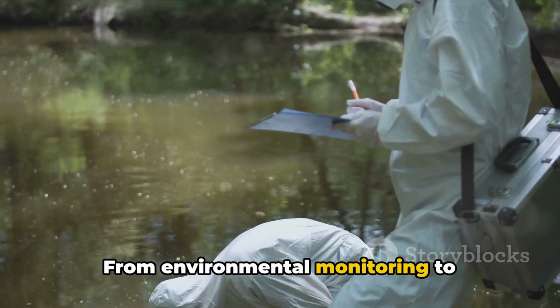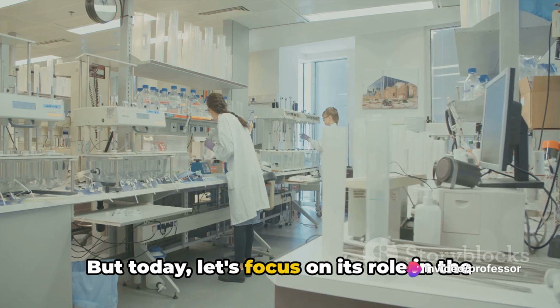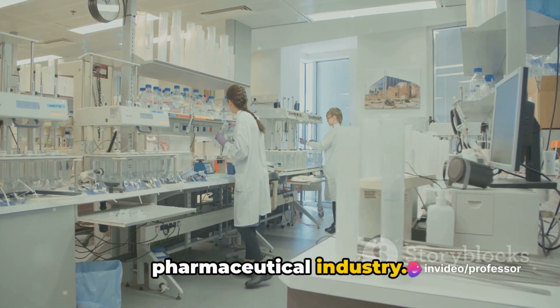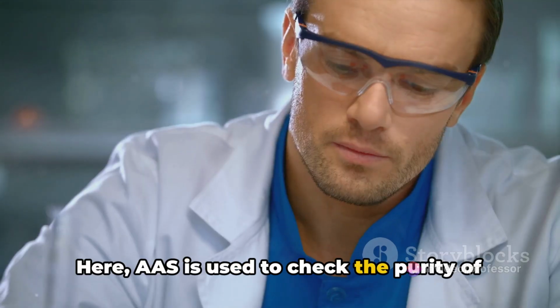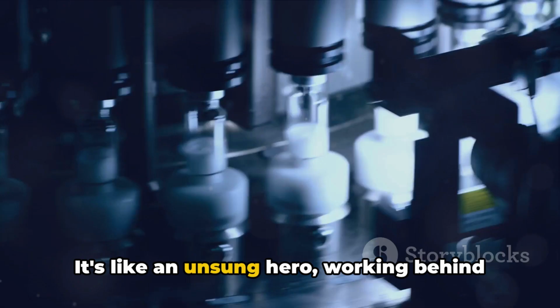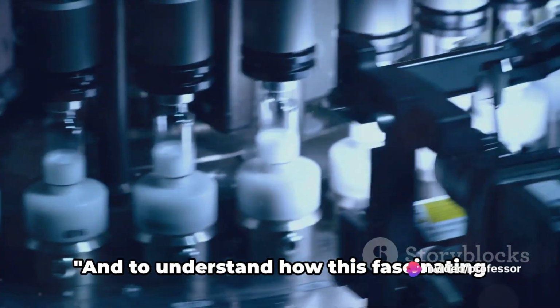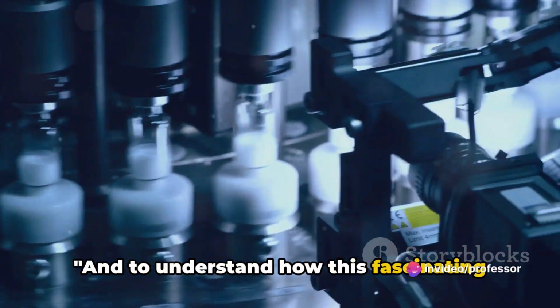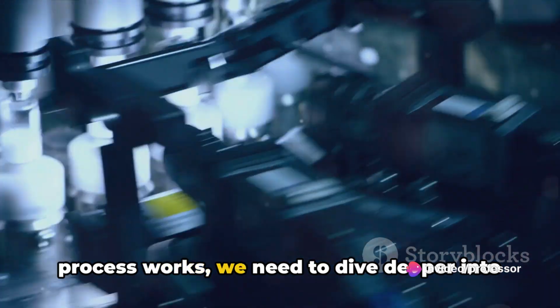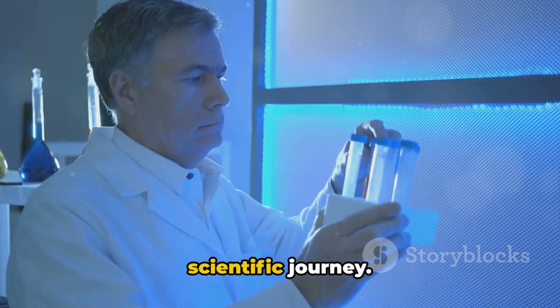From environmental monitoring to archaeology, AAS plays a crucial role. But today, let's focus on its role in the pharmaceutical industry. Here, AAS is used to check the purity of drugs to ensure what we consume is safe. It's like an unsung hero, working behind the scenes to ensure the quality of our medicines. And to understand how this fascinating process works, we need to dive deeper into its theory and instrumentation. So buckle up as we embark on this scientific journey.